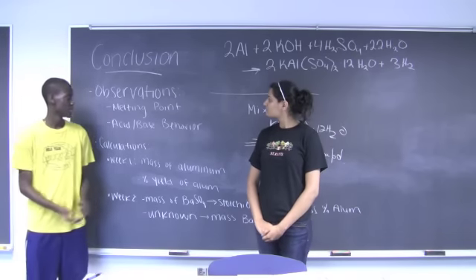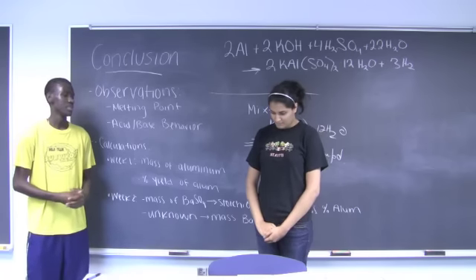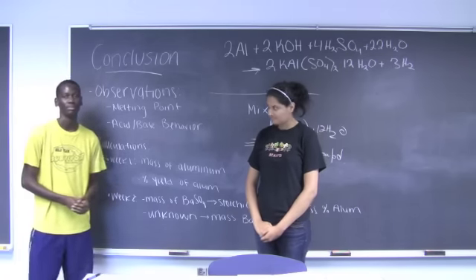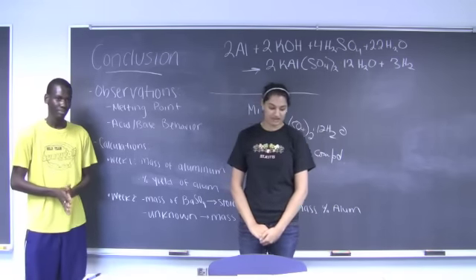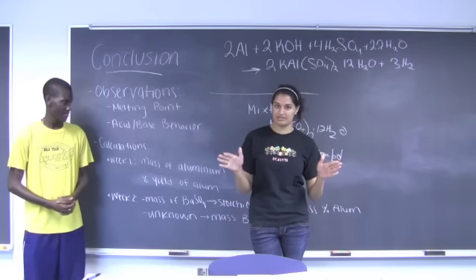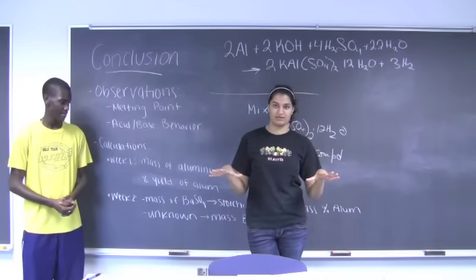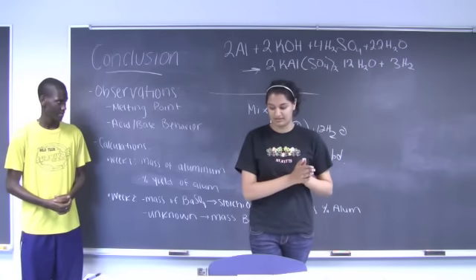Alright, so guys, in conclusion, throughout the point of this lab, you should have been able to determine the melting point as well as the acid-base behavior of the alum. Okay, and guys, when you're doing your calculations, just make sure that you keep them very neatly in your lab notebooks, because this lab is split into 2 weeks and they're pretty much completely different experiments. The first week you're going to be doing the synthesizing, and the second week you're going to be analyzing.